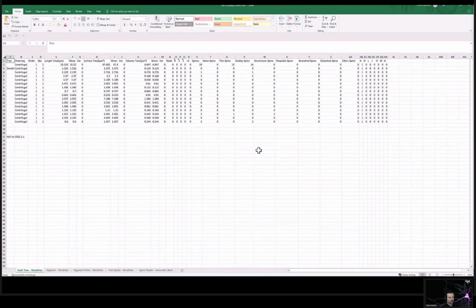All right, so this concludes the end of our batch pipeline. And just to recap, we had 3 different groups that on some images we ran filter, and then on all images we ran automatic detection settings to trace different features depending on the group. From there, we loaded all the resulting XML files into Neurolucida Explorer and took advantage of the batch analysis feature in Neurolucida Explorer to run analysis on all 9 XML files that resulted from our batch pipeline.